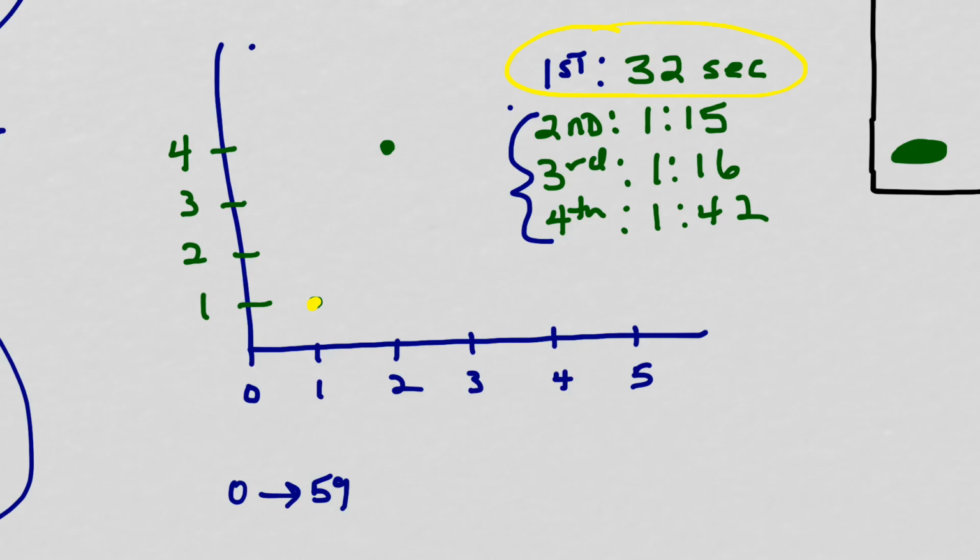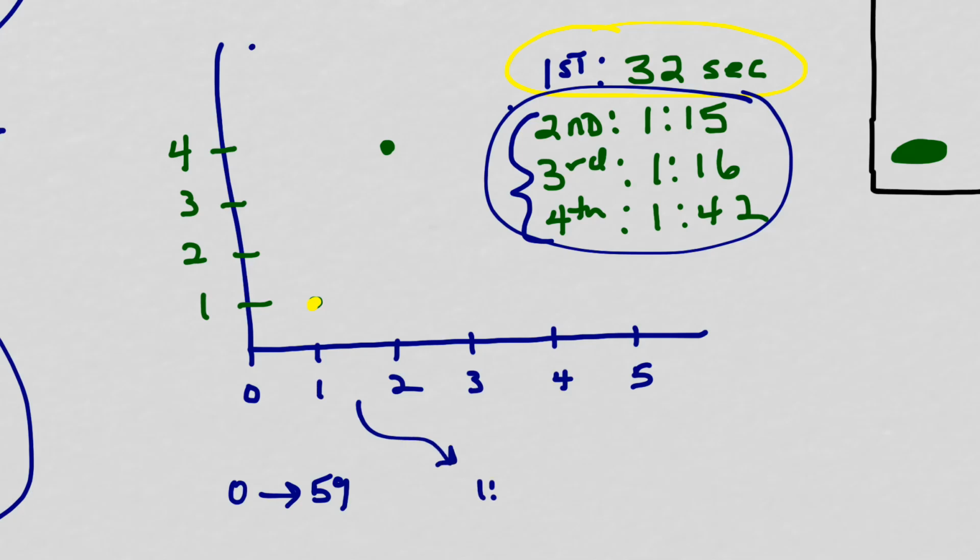Alright, so what we have now is a grouping of 3 disks between the first and the second minute, or 1 minute to the 1:59 minute. So this group right here would be between 1:00 and 1:59. And at 2, you're in the next range. So essentially what you're going to do is take your data table, and if you have the individual times of your disks, you're going to group them into these ranges. And then you're going to make a chart or a graph here, like I'm making, where you're using the cumulative effect of all of your disks.